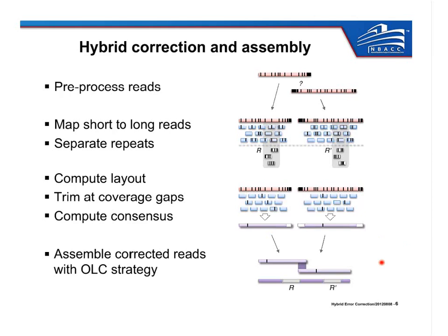We've had good success using the Mira assembler, for instance, which now supports long reads, but it only supports highly accurate long reads. So if you correct the PacBio reads using our approach, you can import them into Mira and it will assemble well. Also, traditional alignment programs such as the MUMmer alignment package that I've developed over the years are very effective at aligning these highly accurate long reads.